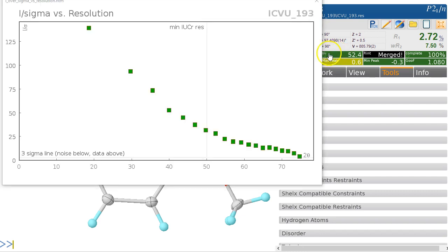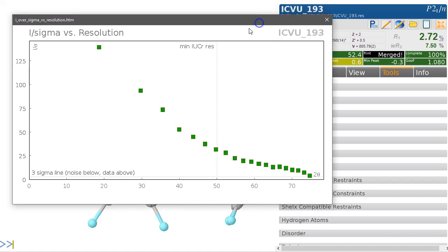If I click on this, I can see the I over Sigma plot, and it's clear that this is very strong data. We have very strong I over Sigma all the way to the ICR limit—we're still looking at 30 to 35 I over Sigma here. It's very strong data.